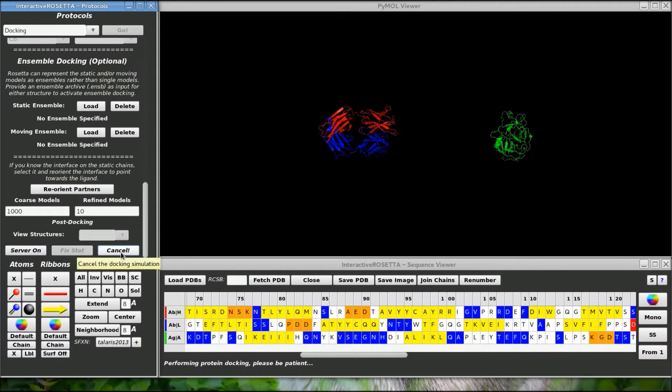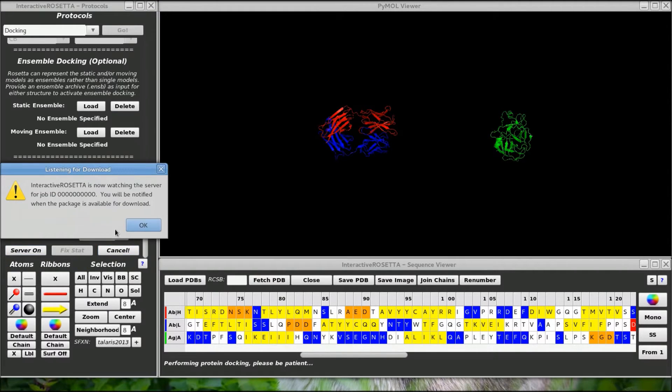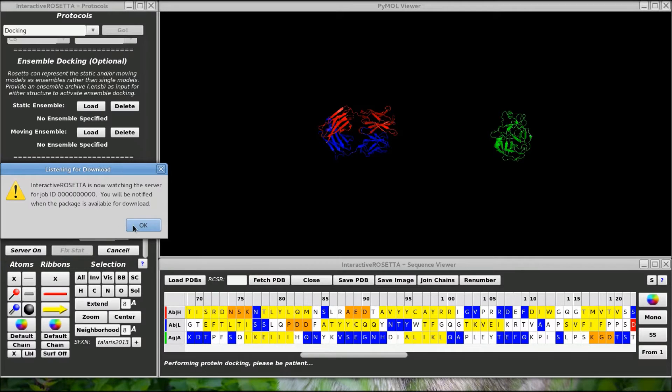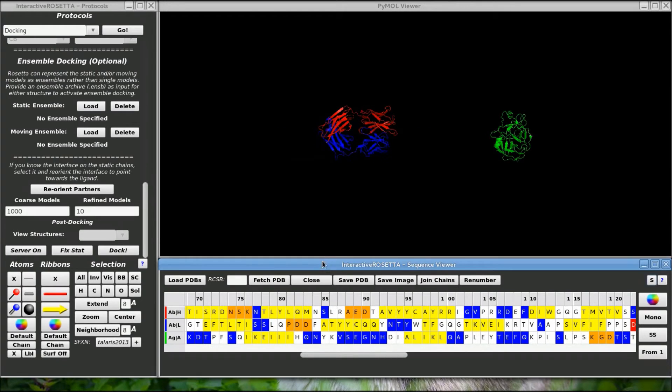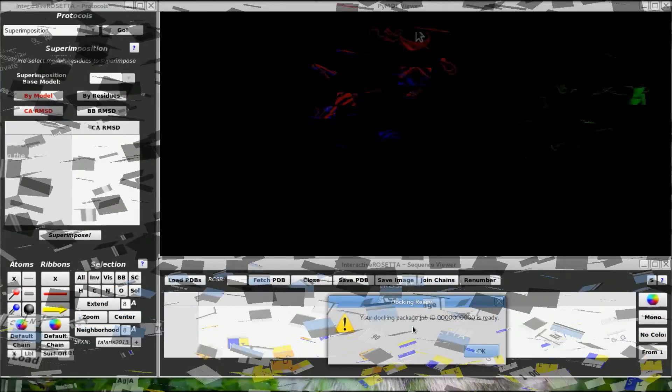It gives me a message that the server received my job, gave me an ID, and will let me know when it is done. If I check the download manager over here, I can see my docking job. The server will give me status updates frequently so I can see how far along the job is. Anyway, this will take a while so I will see you in a bit with the results.